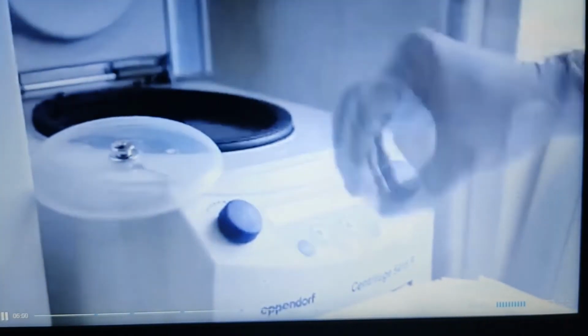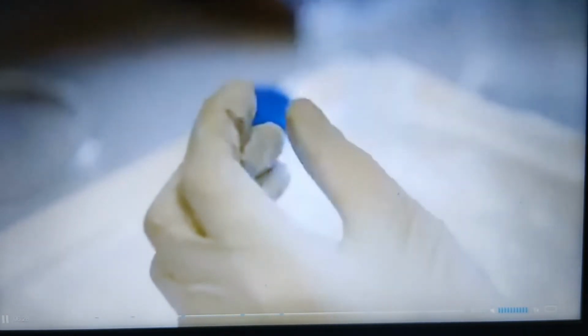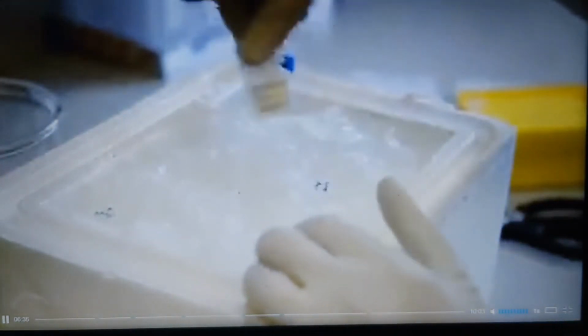Firstly, centrifuge the TEV cleavage reaction containing the rabbit IgG agarose beads to pellet the agarose. Remove an aliquot of the clarified supernatant for analysis. This is sample 4. Carefully remove all the remaining supernatant, which contains your bait protein, to a fresh tube. Again, use fine bore pipette tips to remove all possible supernatant. Retain the rabbit IgG agarose beads for subsequent analysis. This is sample 5.